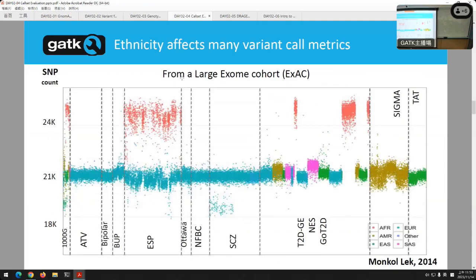And specifically mentioning ExAC a little bit, I think the Exome Aggregation Consortium is what it stands for, they actually took together a lot of different independent projects, and they broke them down by ancestry. Someone asked me yesterday in joint calling how you can tell your data is fine when you potentially mix different people together. I mentioned that you can do analysis later. You can separate by likely ancestry and compute statistics based upon that. And this is an example.